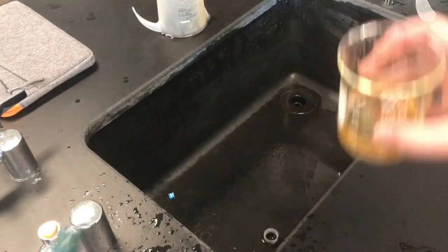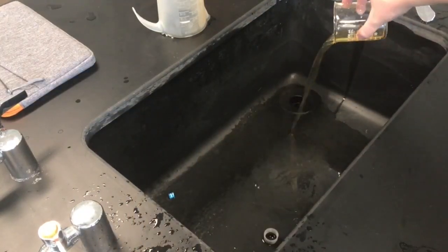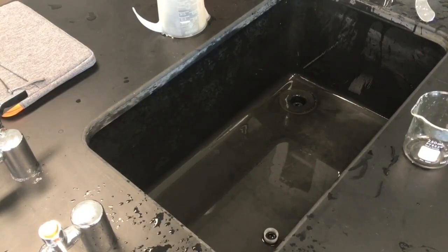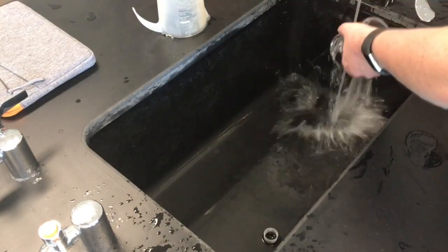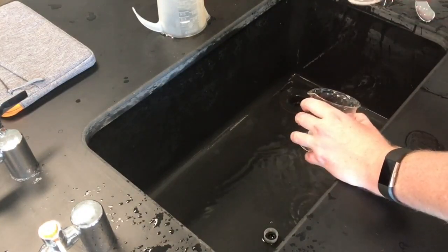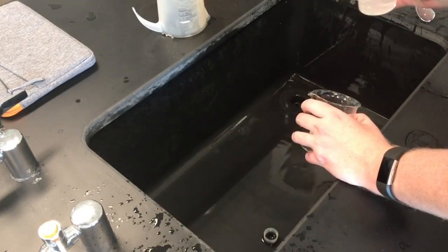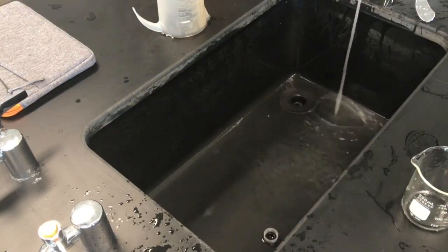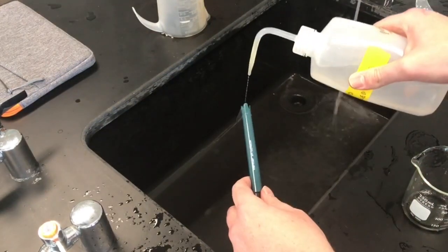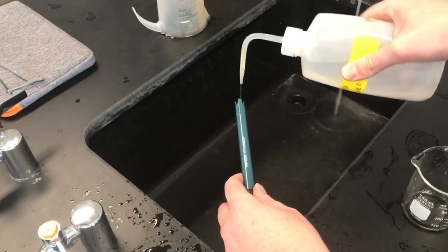I'm going to dump my acid. Once you've dumped both of your acids down the drain here, you're going to want to make sure that you rinse out the inside of each of your beakers here. And I'm going to just make sure right away that I have my pH probe sprayed off for the next trial.